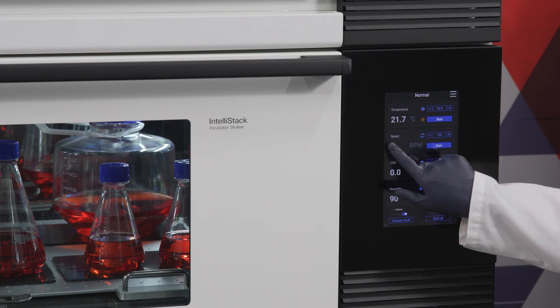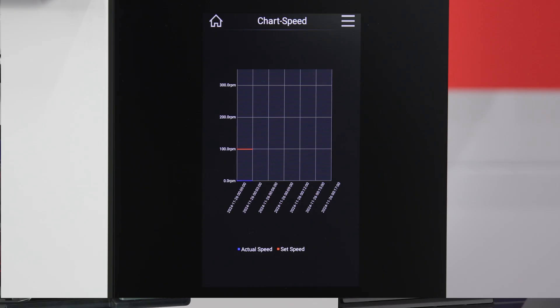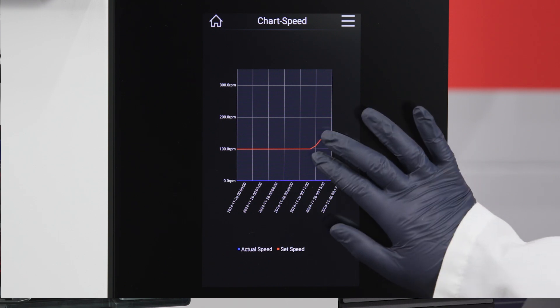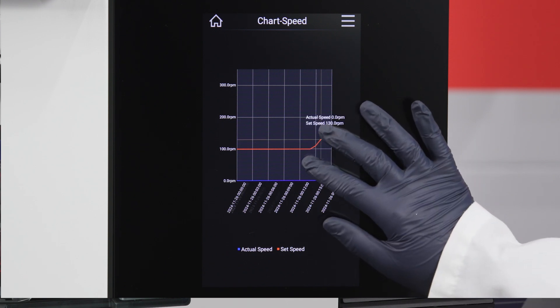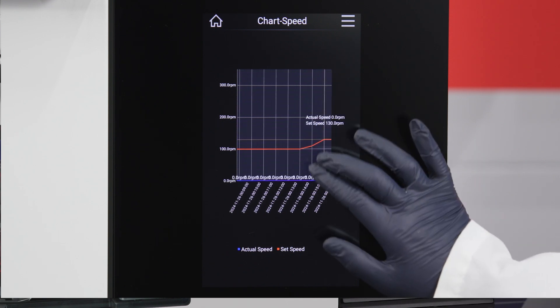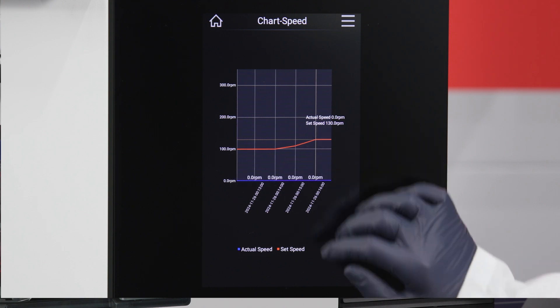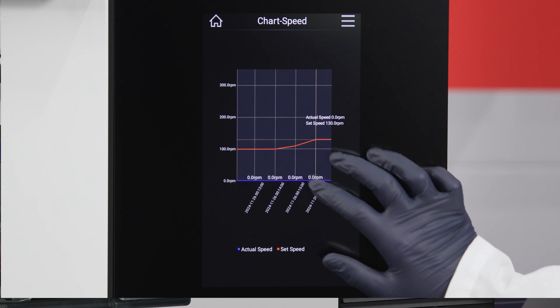Within each panel, you can view a real-time performance curve by tapping the large number on the left. Pinch the view in the performance curve display to zoom in or out and adjust the time frame you're viewing.